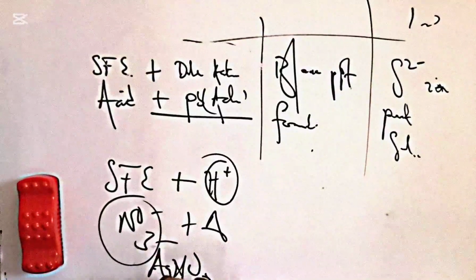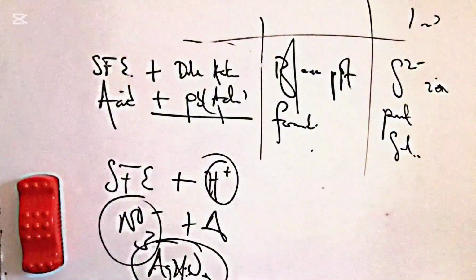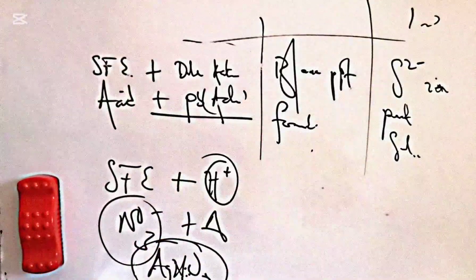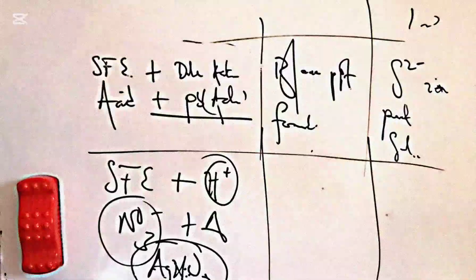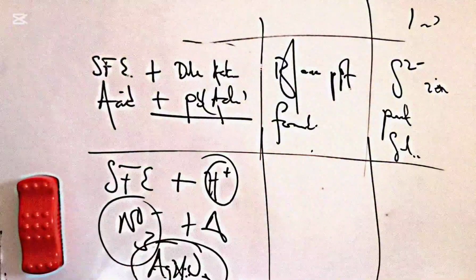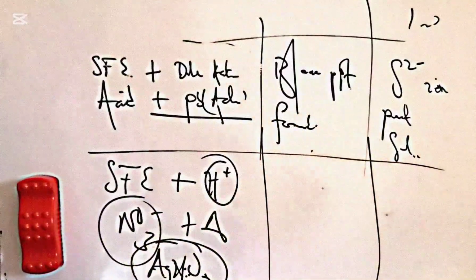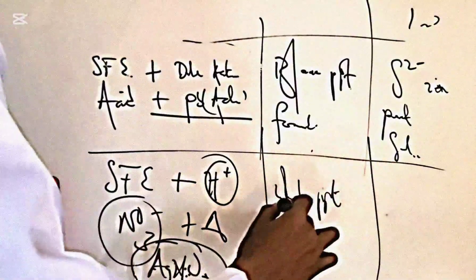Basically, each time silver nitrate is used in qualitative analysis, you just have it at the back of your mind that you are about testing for the presence of chloride ion. And chloride ion forms a white precipitate with silver nitrate. But this silver nitrate tells you already, if you go through your procedure, that chlorine could be there. And if chlorine is there, you look at your procedure, what color is it? What color did you observe? Some of you are writing thick white precipitate. Okay, fine. You are trying to describe, okay? But you could just write white precipitate formed.